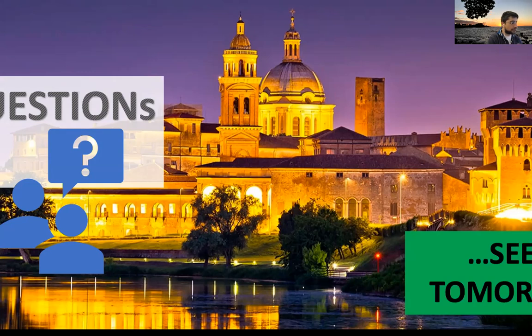What they usually do is they tell you what type of adapters you can use depending on the kit the adapters are coming from. What I'm telling you right now is the best practice is to use unique dual indices. And the problems usually occur when you have only a few libraries in the same lane. But if you have many libraries, let's say more than 4 or more than 10 or more than 20 libraries in the same lane, then the question you were asking before, what indices shouldn't be combined, doesn't apply.